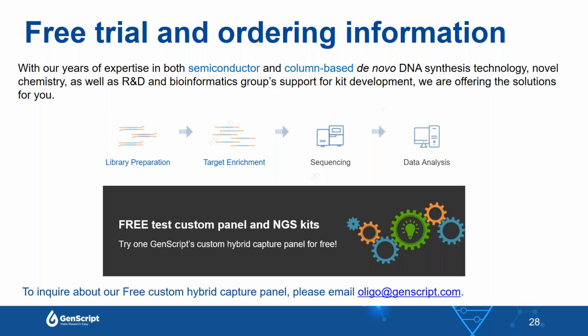Okay, thank you. And the second question is, our lab is actually doing amplicon-based target enrichment, and we use semiconductor technology to make amplicon primers.